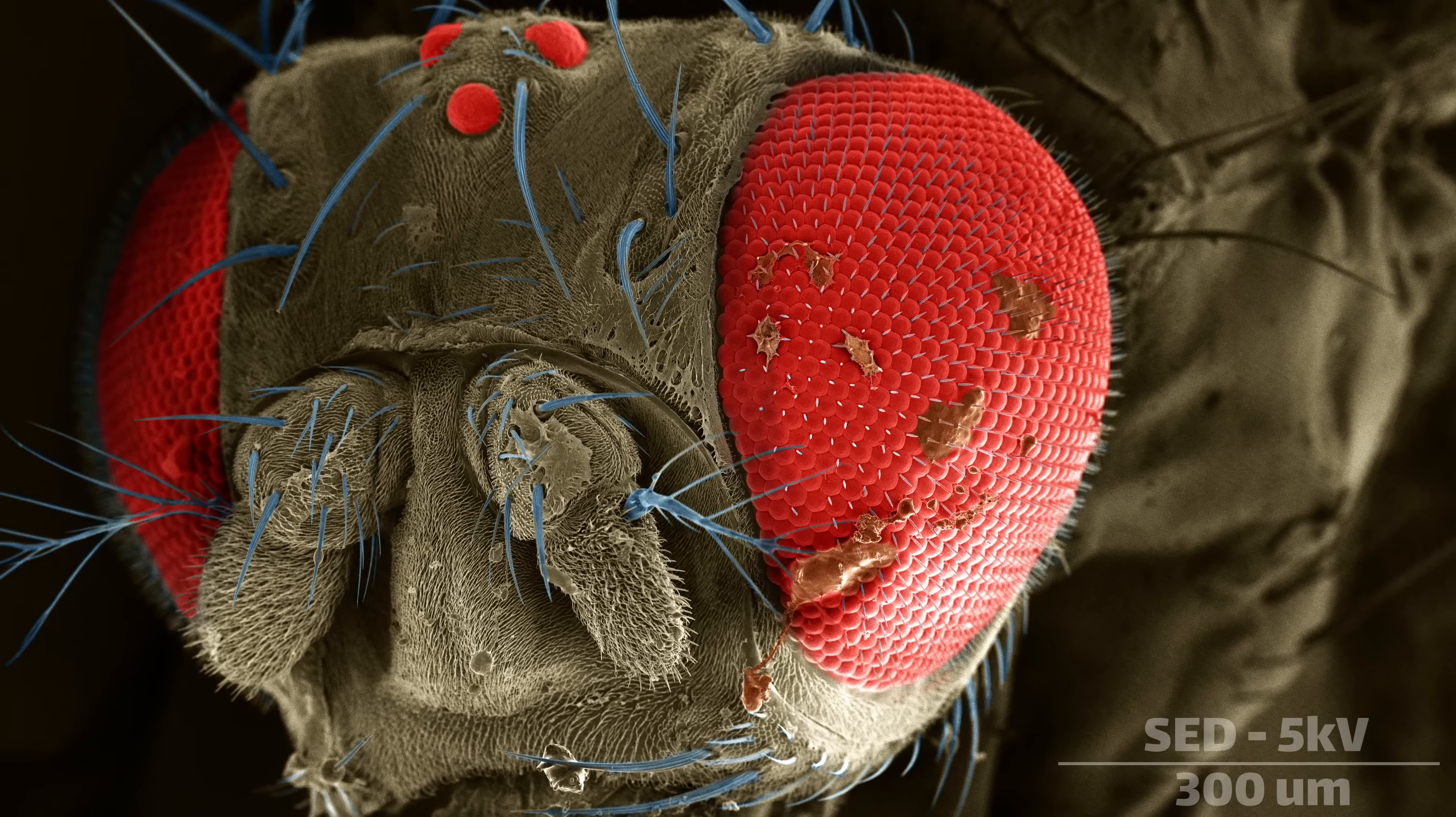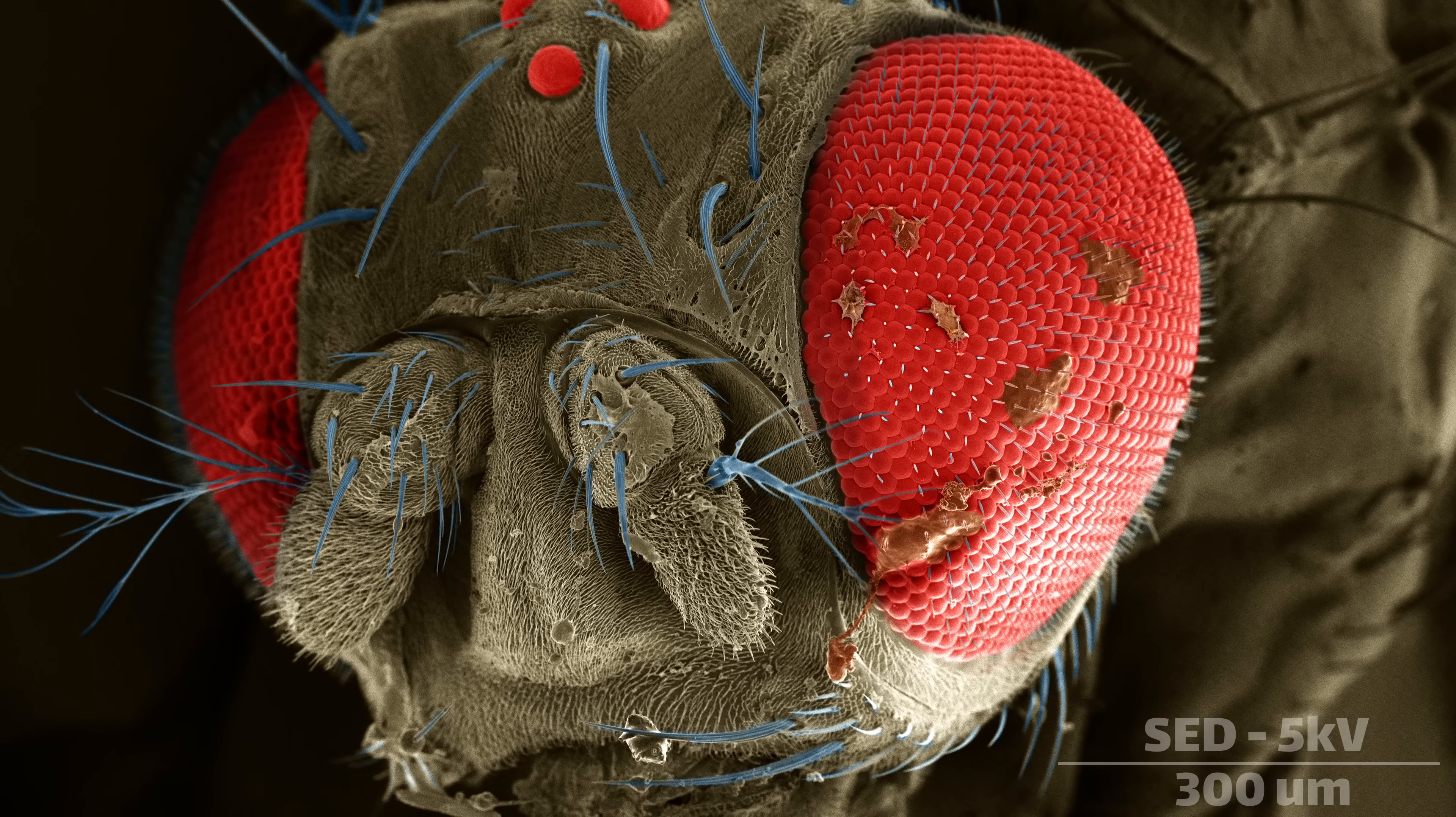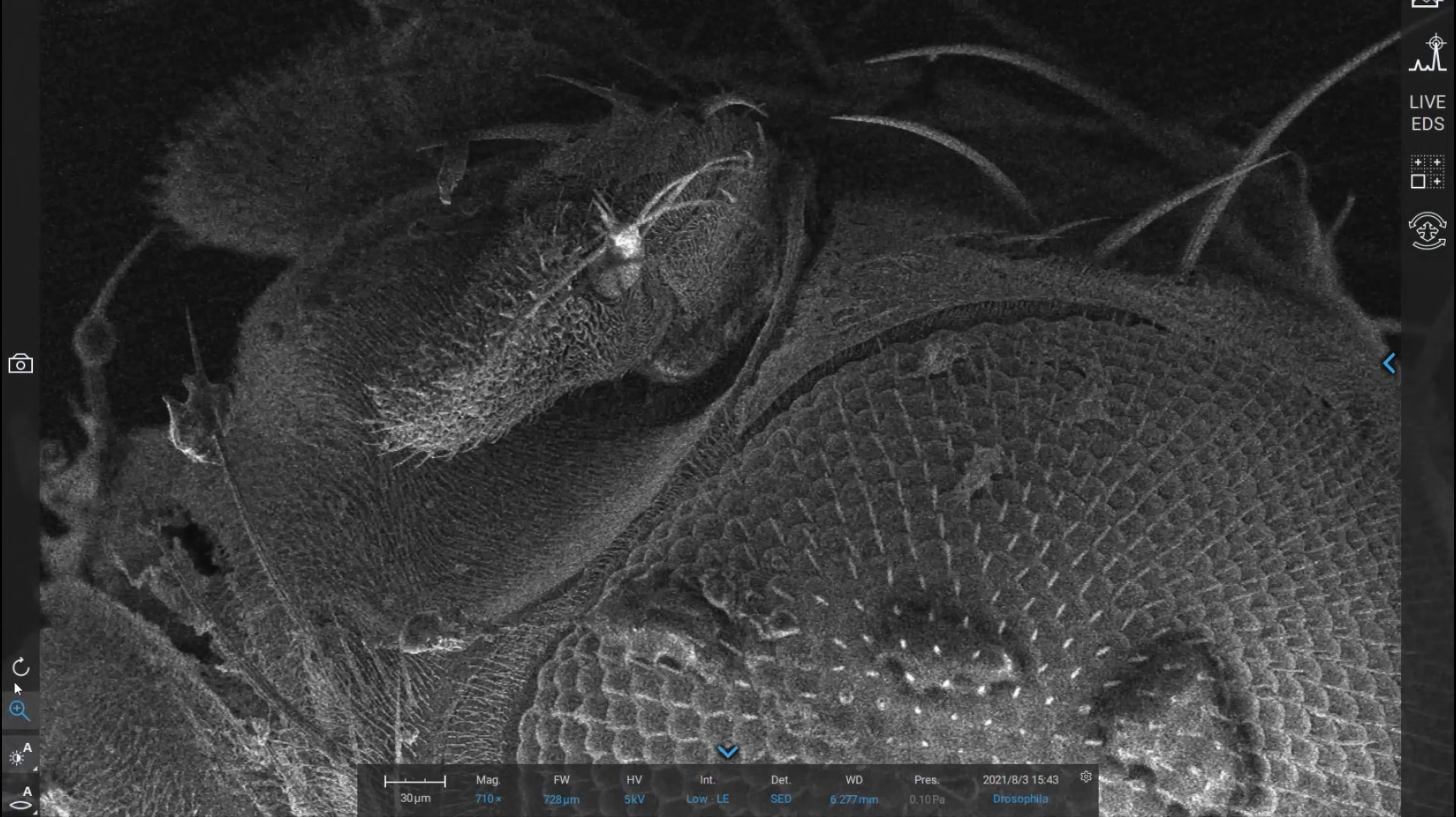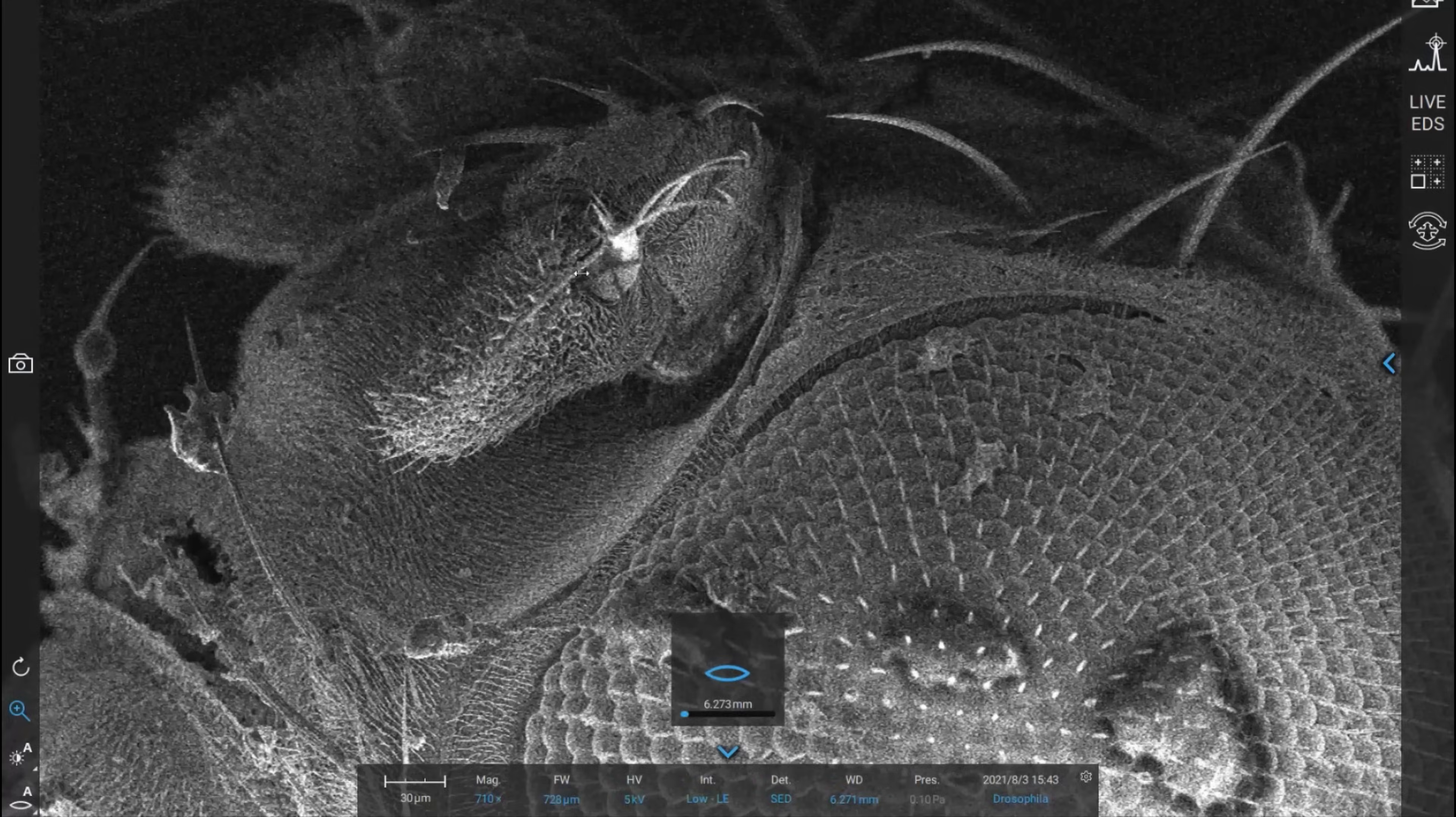Even the most mundane or forgettable subjects can become endlessly beautiful when viewed at the microscopic level. The crystalline symmetry of common table salt, or the organically alien landscape of an oak leaf, all show remarkable beauty when viewed at a high enough magnification to see the details that are normally obscured by the inferior instrument that is our eyes.